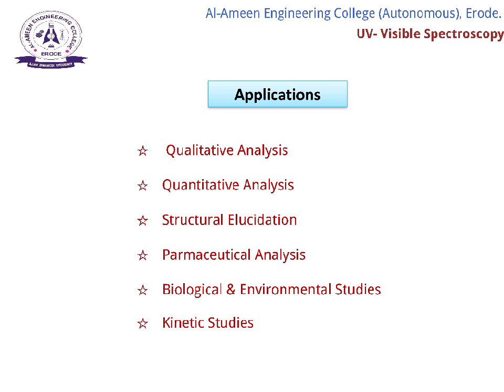Let's see the applications. Identification of compounds, determination of concentration, determination of presence of conjugation, used in quality control for drug assay, purity testing, and stability studies, measurement of nucleic acids and proteins in biological samples, monitoring pollutants or trace elements in water samples, used to study reaction rates by monitoring absorbance change with time.